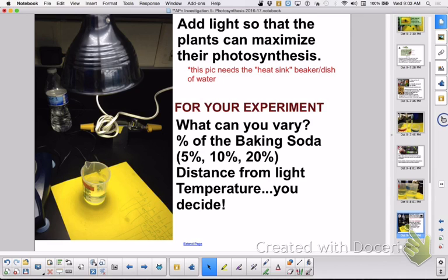Anytime you put grease on a bulb, that's an area where the light will be focused. It can get hotter because of the oils. So try to touch this as little as possible. Take out the bulb I have in there, put it in here, and put this one in instead. And then I'll pick these up at the end when you put them back up here. Does that make sense? In team 1, I've already done yours.